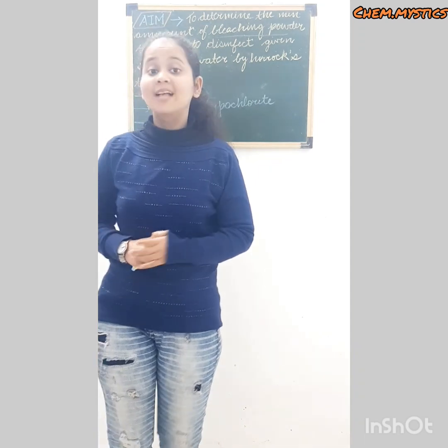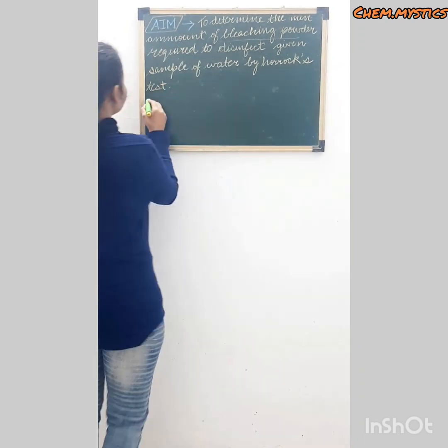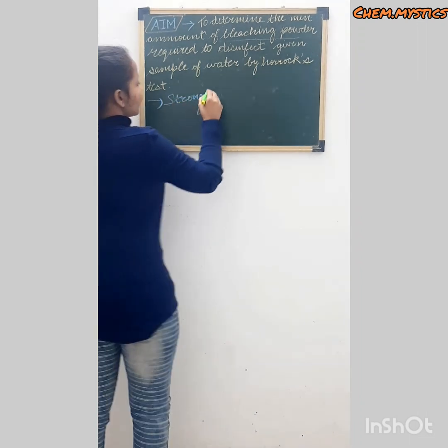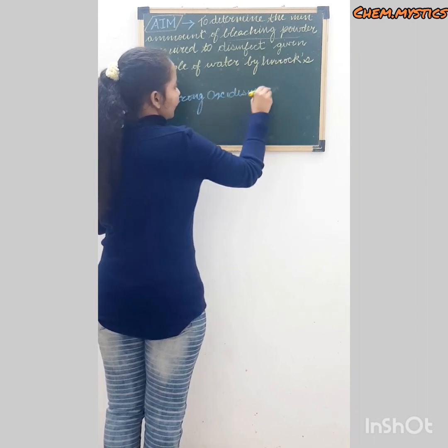Like, it is used as a strong oxidizing agent.